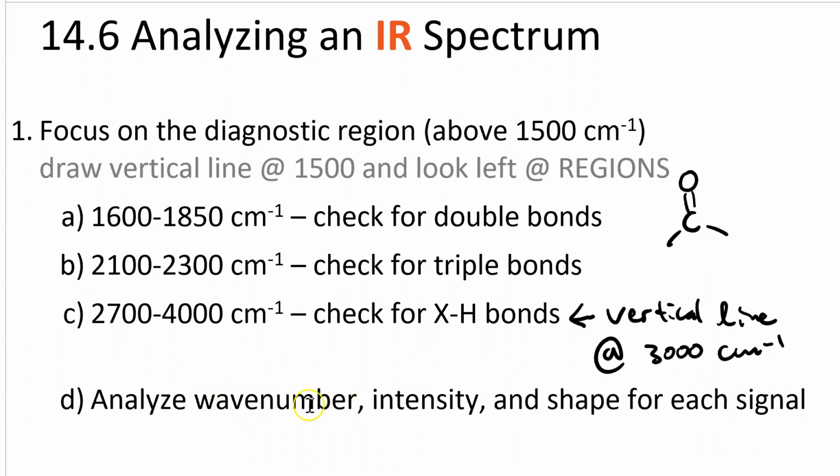Right, you can differentiate between a pair of double bonds by saying, like, a conjugated ketone or a conjugated ester will have a lower wave number than one that's not conjugated. Broad signals are participating in hydrogen bonding. The more intense signals are between atoms that are further apart on the periodic table. That is, they have a greater difference in electronegativity, or the molecule is less symmetric.